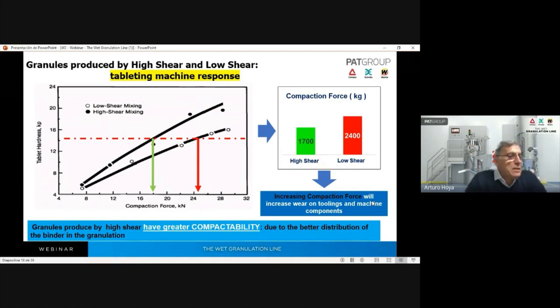Well, to compare the physical properties of the granules, the mechanical strengths, the most common method is friability. The very same method that we use with tablets, in the same equipment, is used for granules.